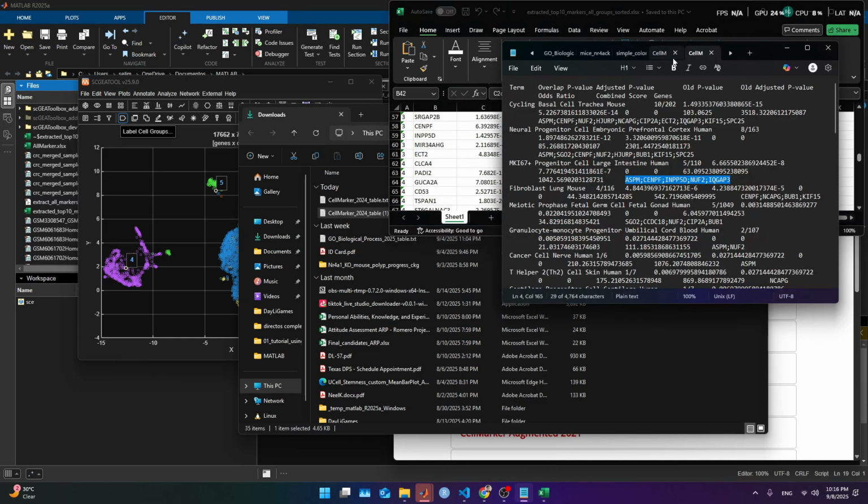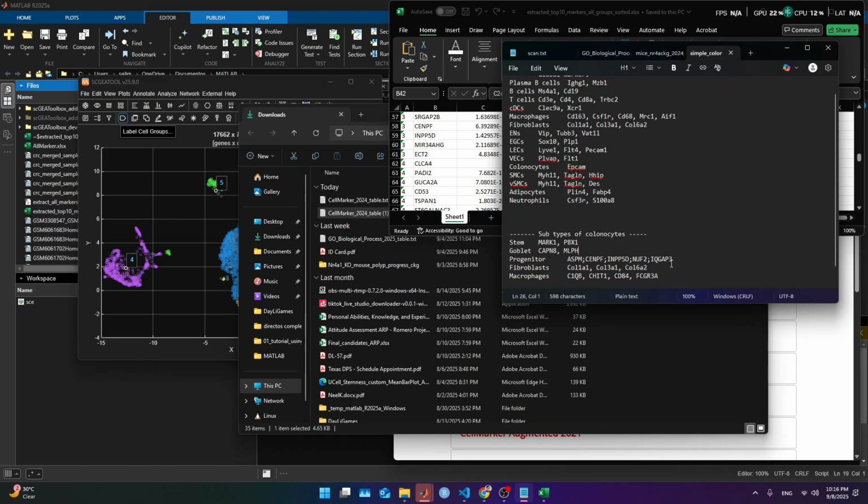So what we're gonna do again is copy this into progenitor. I think it's the same. We build, we build, and that's it. We are gonna use this set to verify things later.